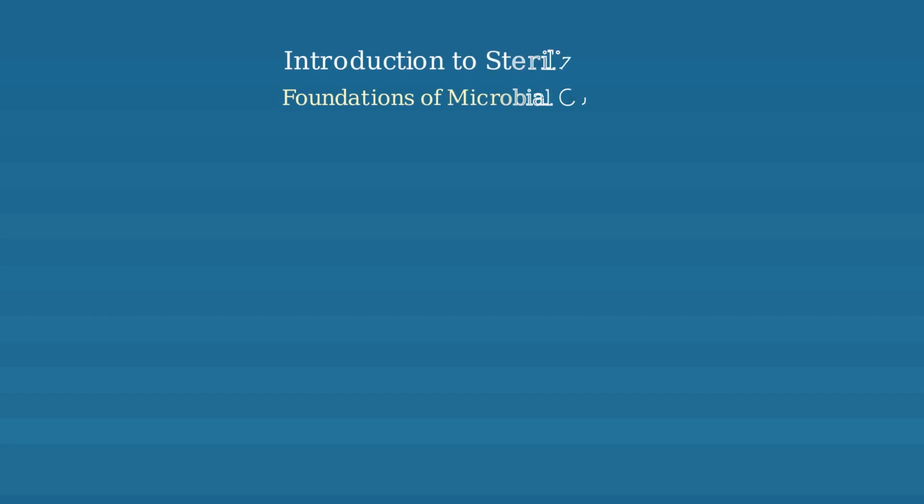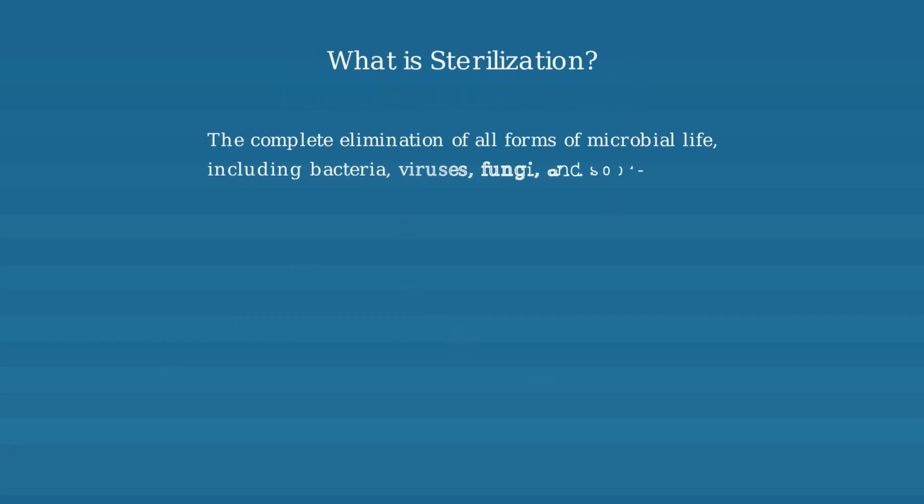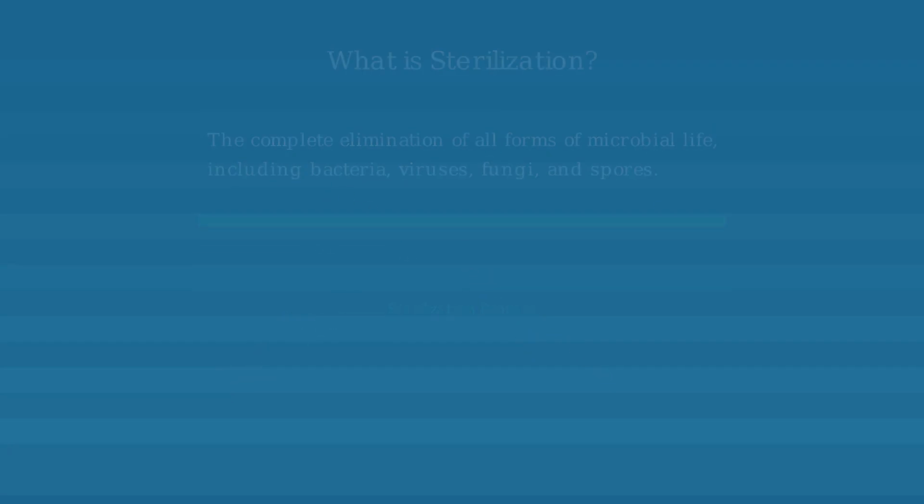Welcome to our Introduction to Sterilization, a fundamental process in microbiology and healthcare. Sterilization is defined as the complete elimination of all forms of microbial life. This includes bacteria, viruses, fungi, and even resistant bacterial spores.